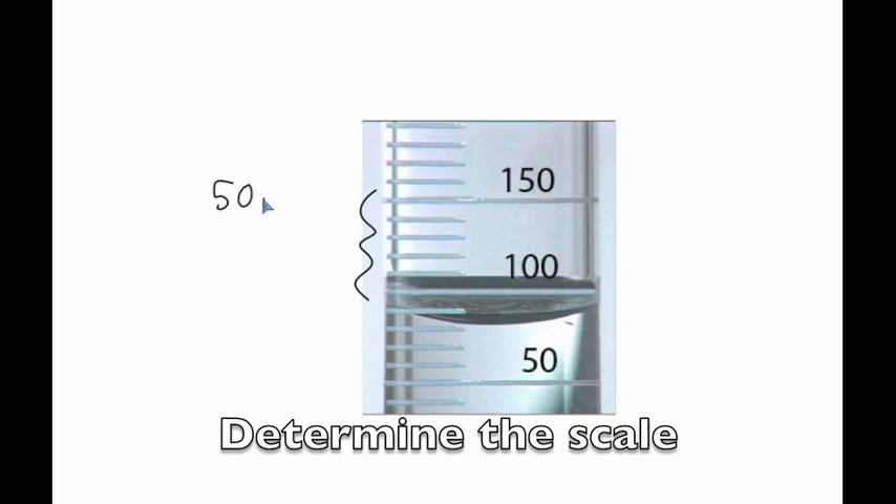They're separated by 50 milliliters, and we count the number of lines to go from 100 to 150. There are five lines, which means each line is worth 10 milliliters.